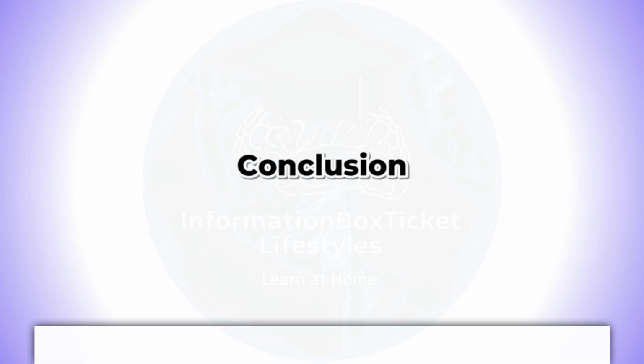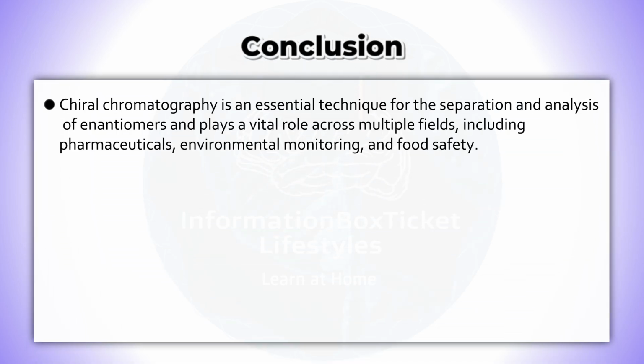Conclusion. Chiral chromatography is an essential technique for the separation and analysis of enantiomers and plays a vital role across multiple fields, including pharmaceuticals, environmental monitoring, and food safety.